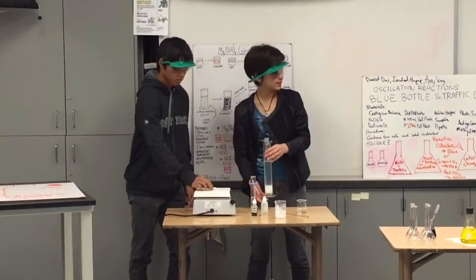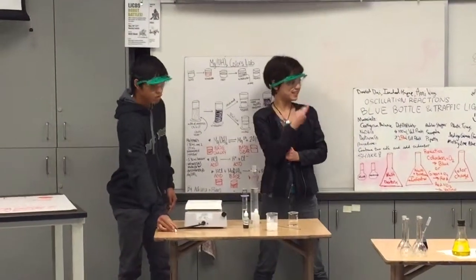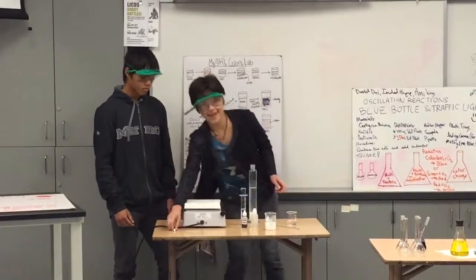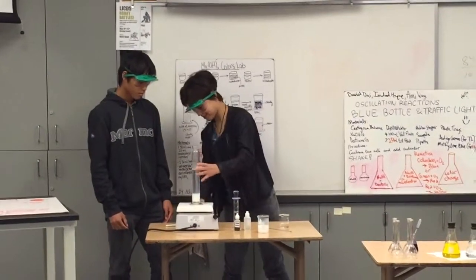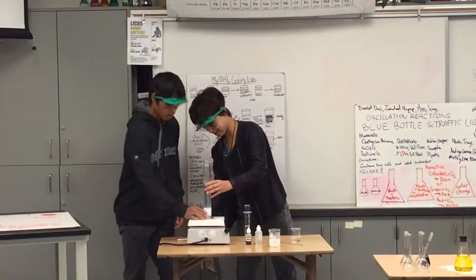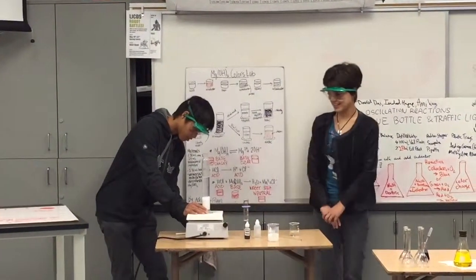What is in that that makes it spin like that? It's a rotating magnet. So something that's magnetic, like this, inside here, it will spin with the magnet. You can see it's stirring.